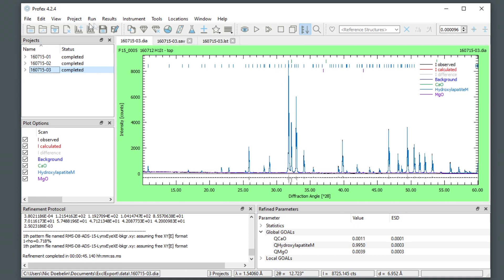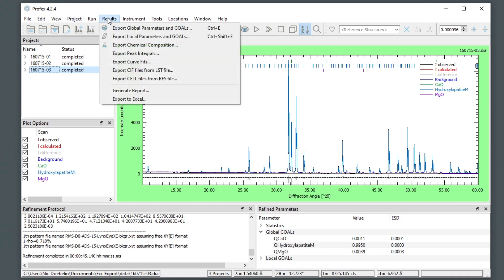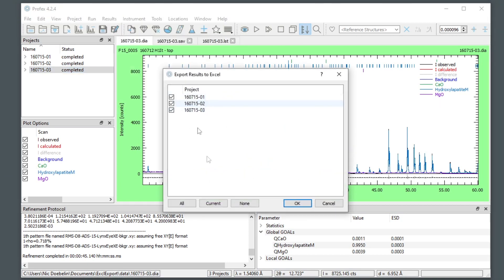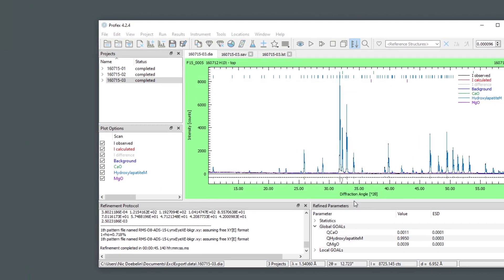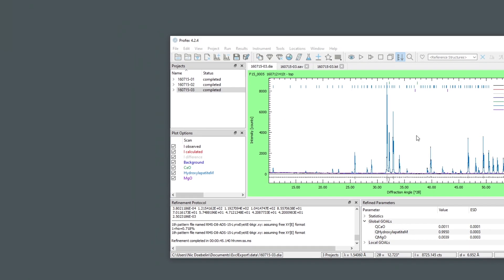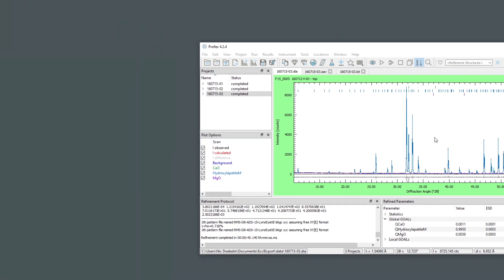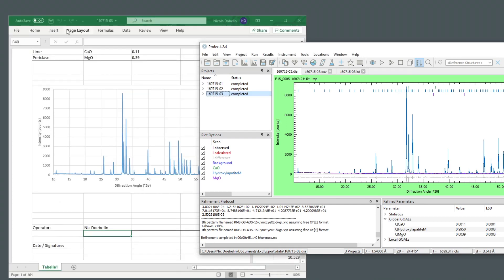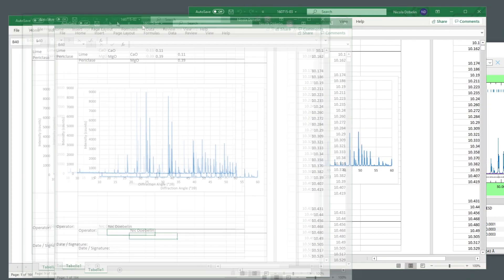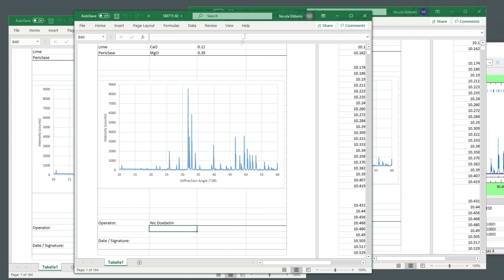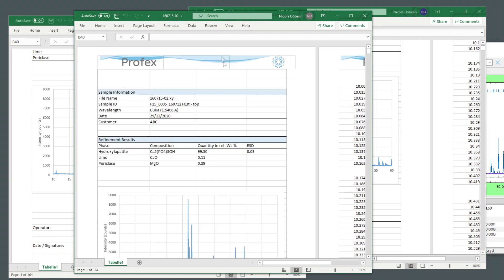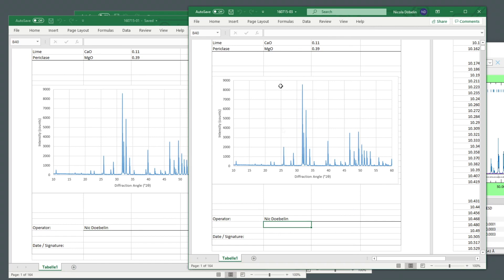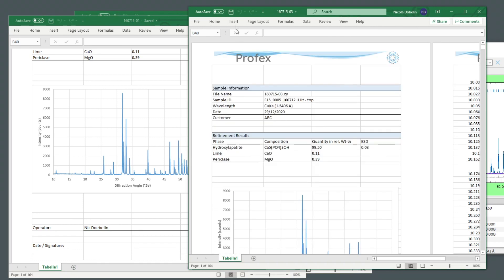And when all three refinements have terminated, I can export the results to Excel. I check all three projects. And here I get all my three test certificates with the customer name. And all I have to do is save all of them again with the exported results. And that's it.